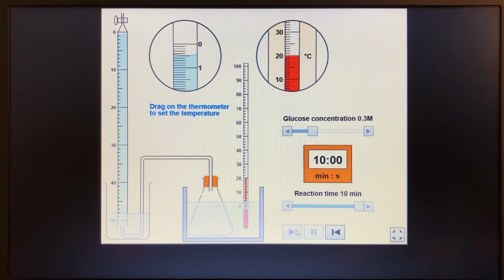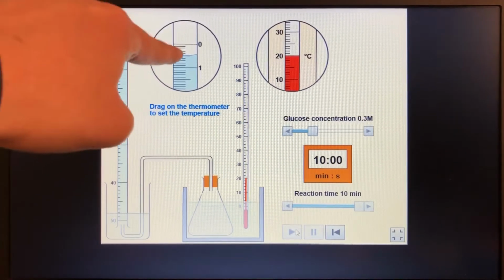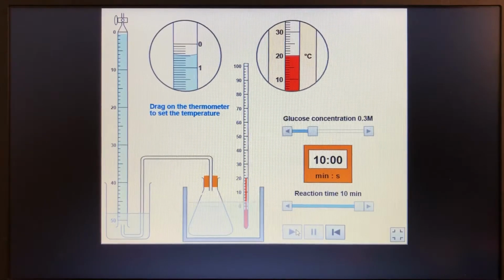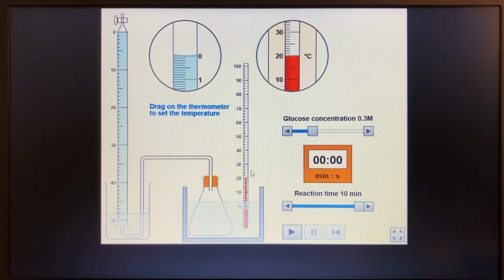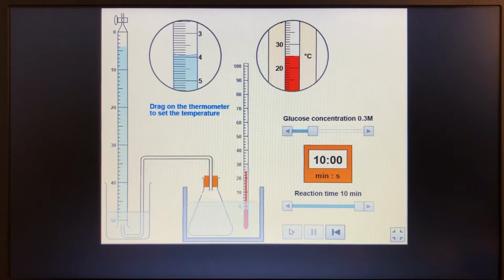And we've finally got some gas produced. Now be careful how you read this because it's kind of upside down, okay? 0 is here and 1 is here. And it's where the middle part, the meniscus of that bubble is. So I've got that at 20 degrees, 0.5. Okay. And now we'll go to 25. Much more gas produced this time, and I'm saying that is 3.9.